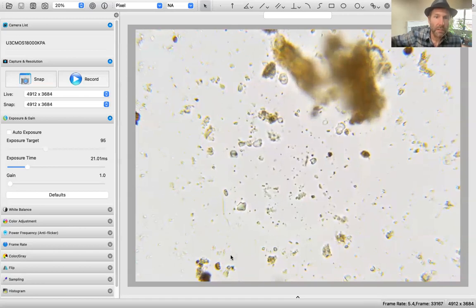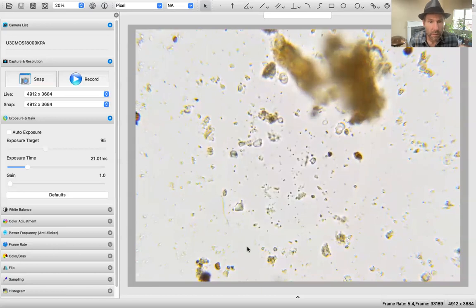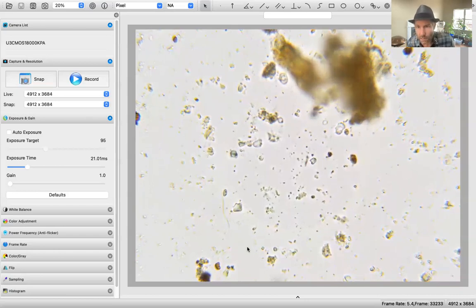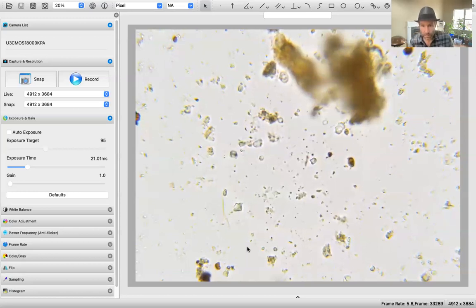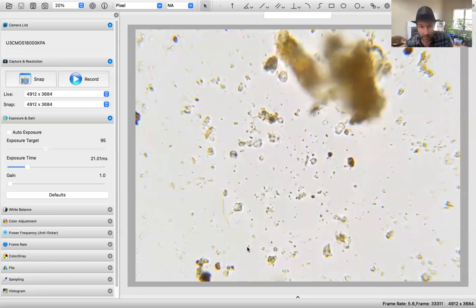Is that a flagellate? No, the upper left has the morphology of a flagellate, but no flagella. There are some tiny flagellates in here. I got them on the last assessment I did of this, but I don't see them now. So okie dokie, that's going to be just that actino then.